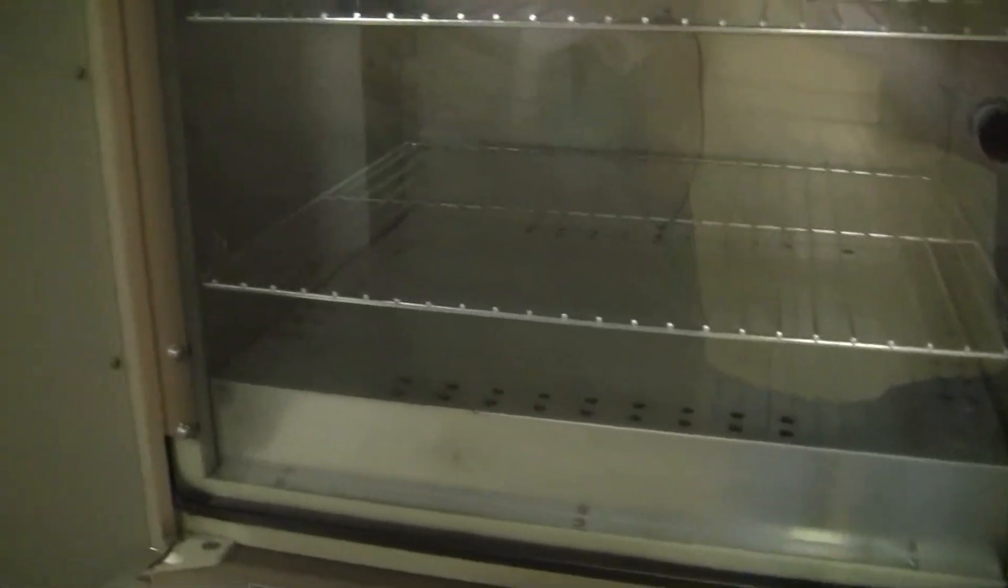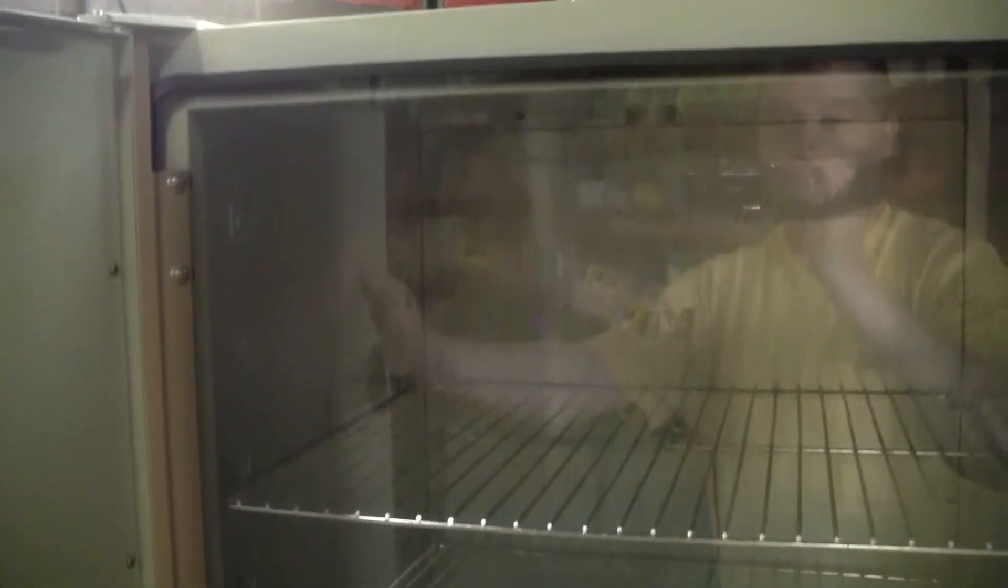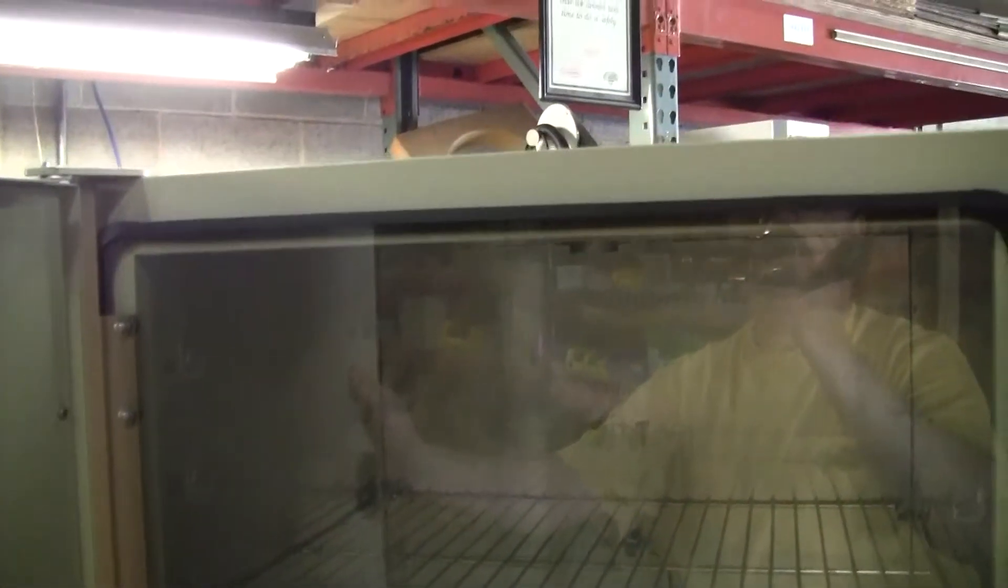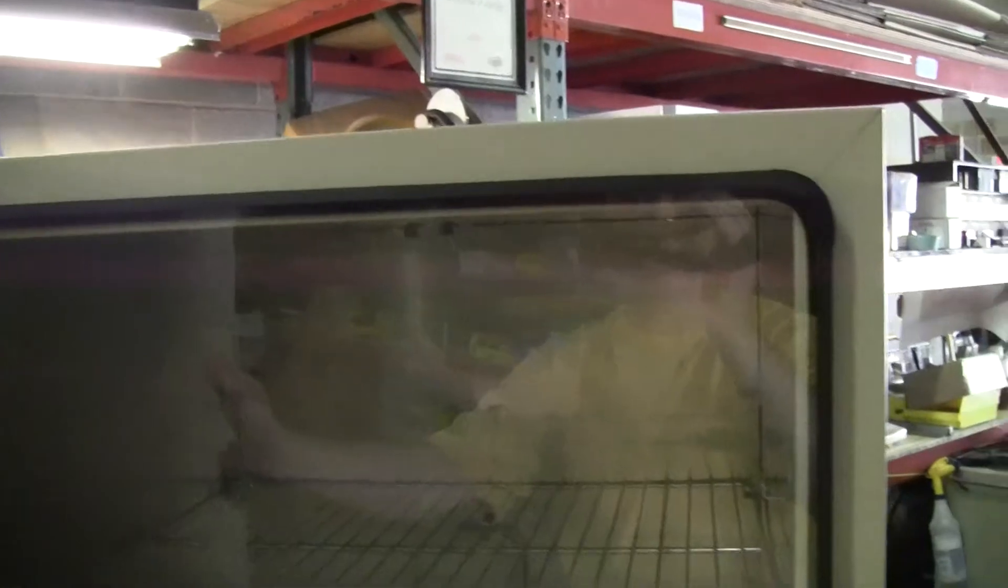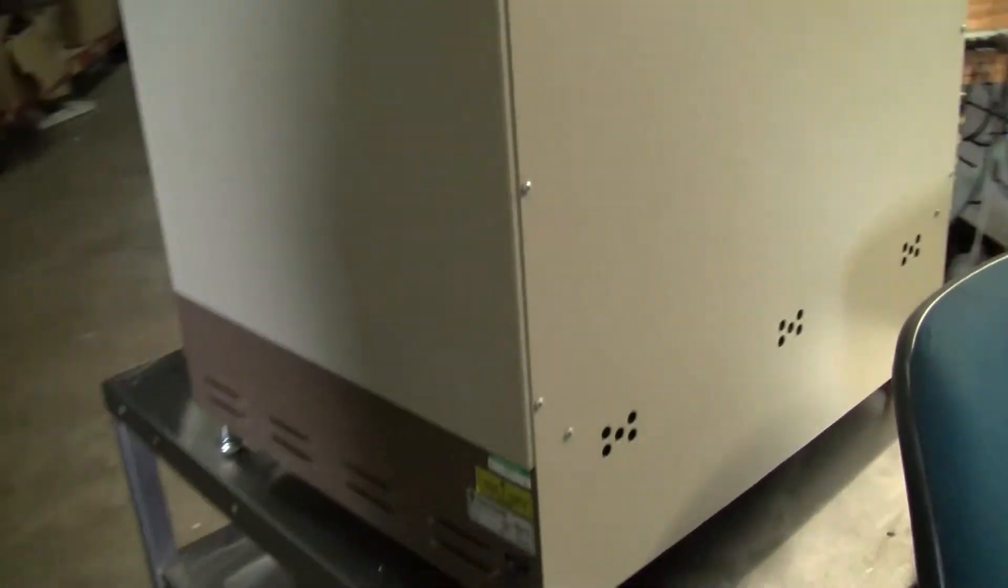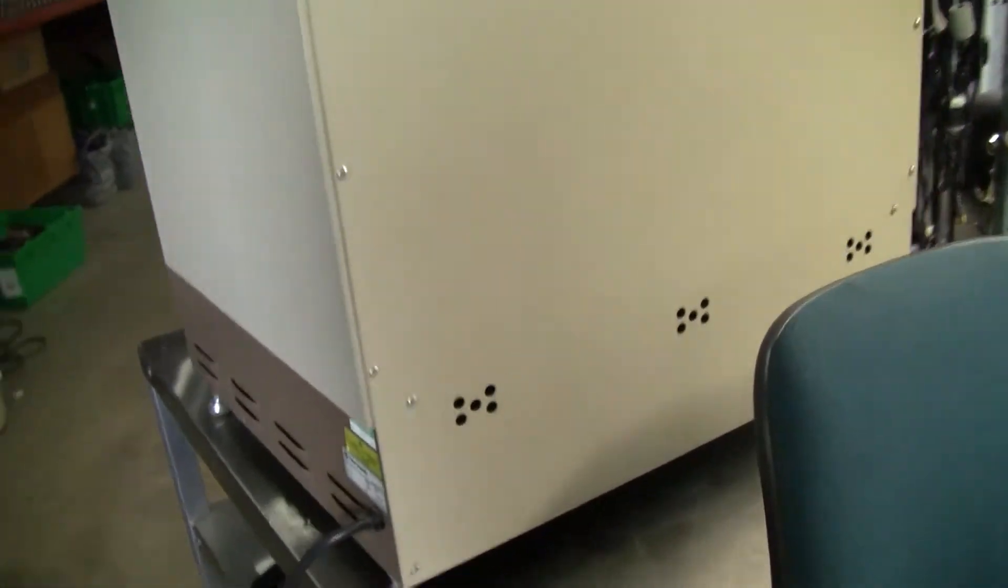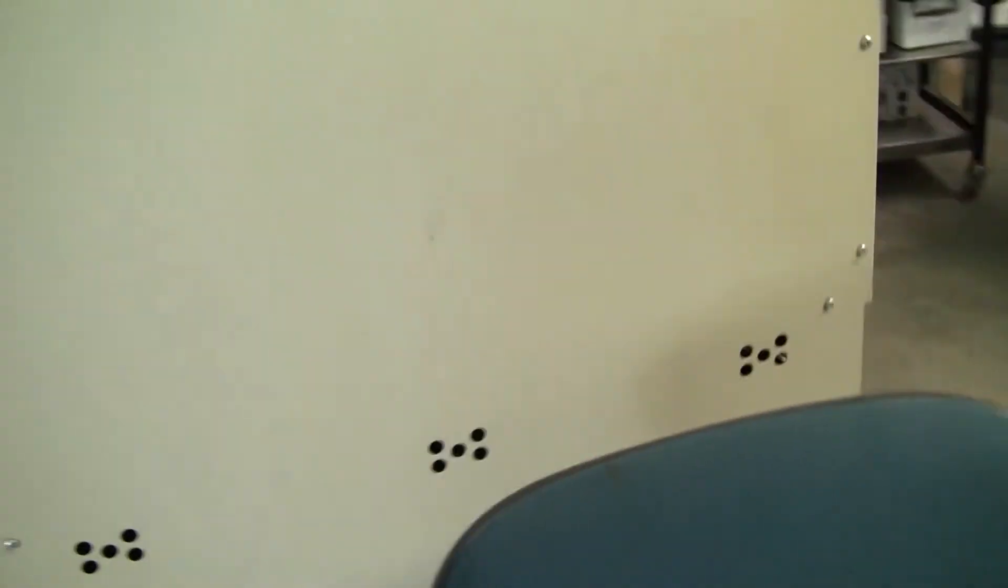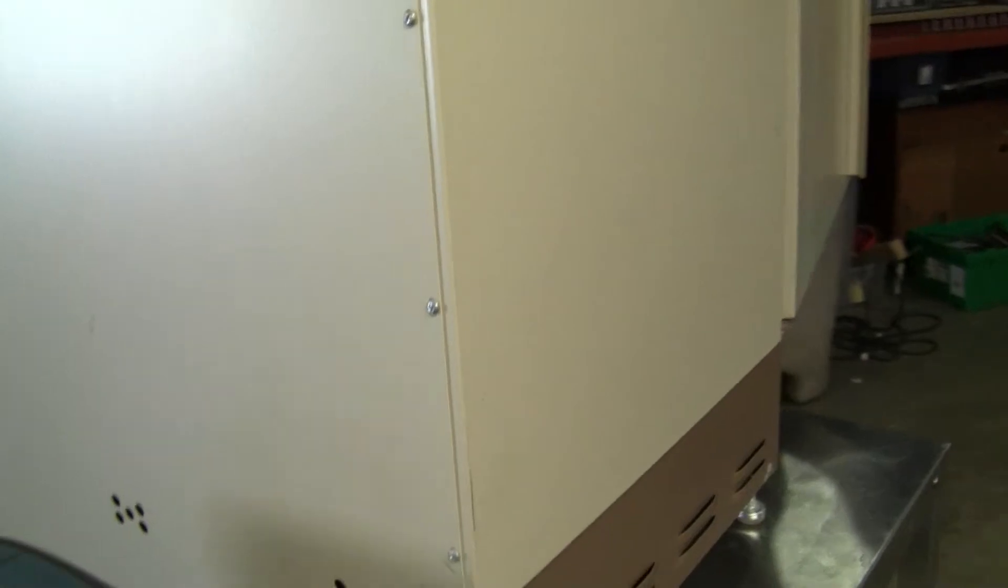Inside. This unit runs on 115 volts. Exterior looks to be in excellent shape.